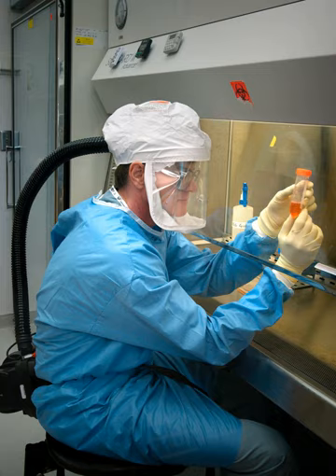A Biosafety Cabinet — also called a Biological Safety Cabinet or Microbiological Safety Cabinet — is an enclosed, ventilated laboratory workspace for safely working with materials contaminated with pathogens requiring a defined biosafety level. Several different types of BSC exist, differentiated by the degree of biocontainment required. BSCs first became commercially available in 1950.